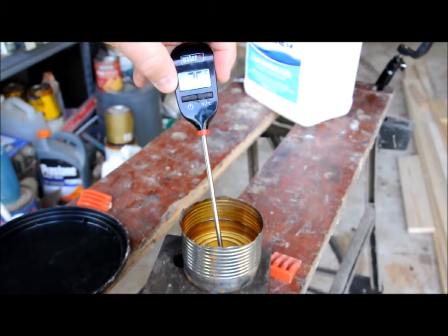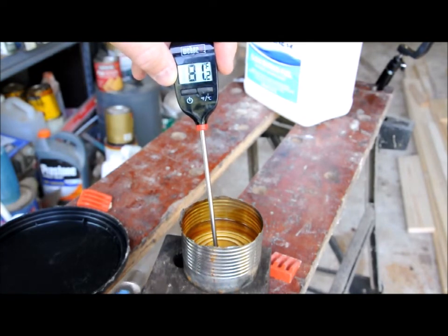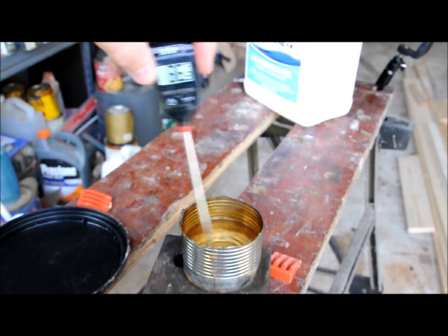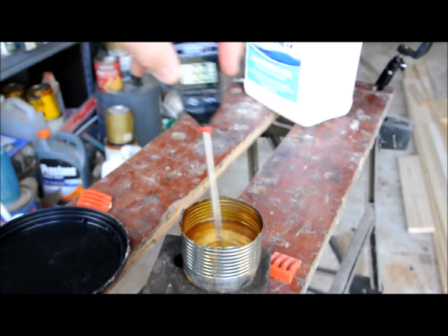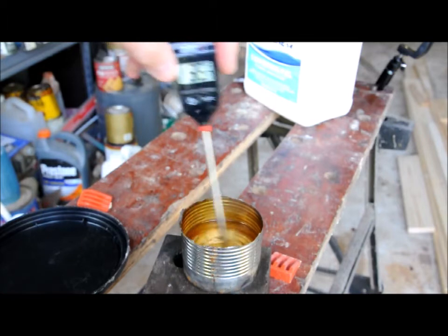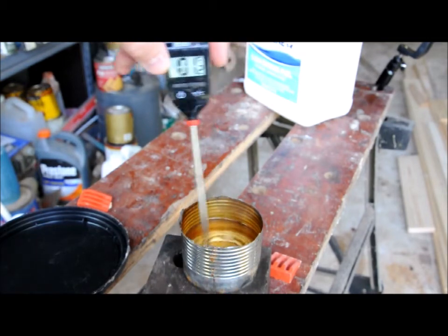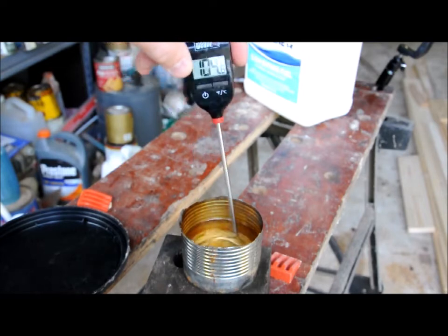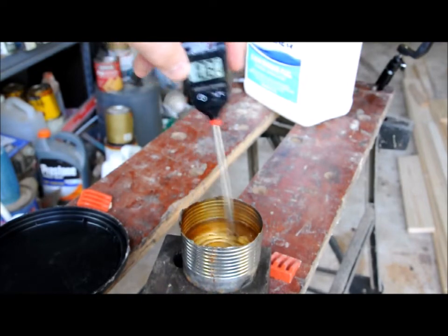Now we are up to 75. No flash. Stir it so you keep it even. Now we are up to 88 degrees. No flash. 92 degrees. No flash. 97 degrees. No flash. Now we're up to 100 degrees. No flash. 105. No flash.